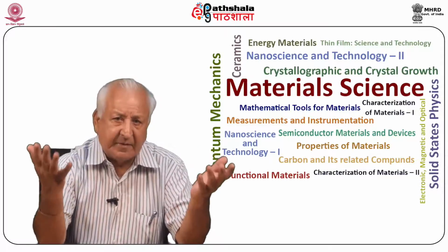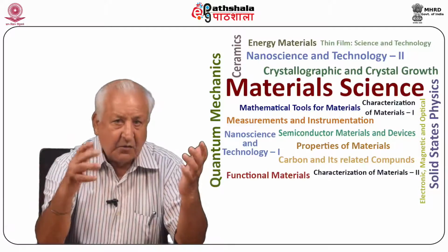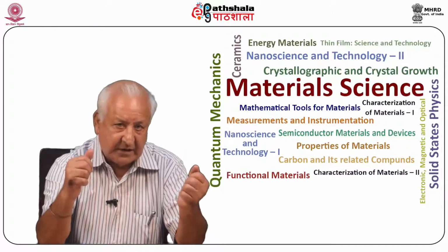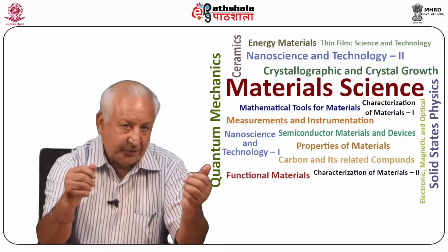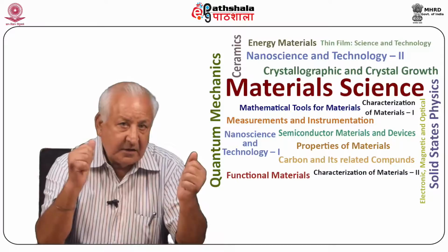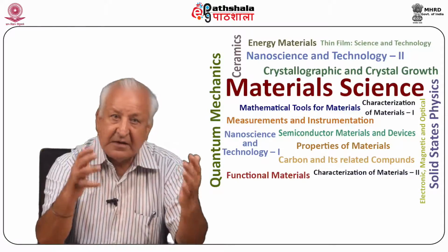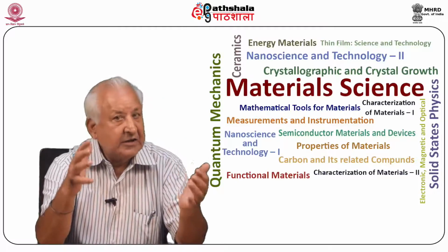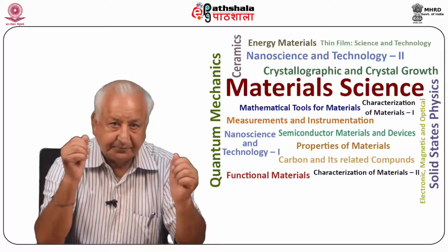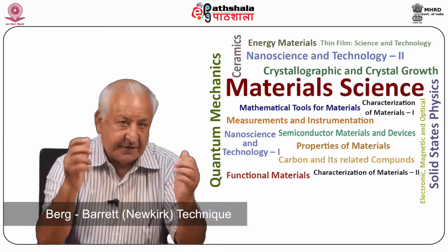There are a number of experimental arrangements for recording X-ray topographs. We may describe here two types of experimental techniques that are widely used. These two techniques are the Berg-Barrett technique, also known as the Newkirk technique, and the second one is the Lang technique. These two techniques may be described in the sections that follow. The Berg-Barrett Newkirk technique will be taken up first.